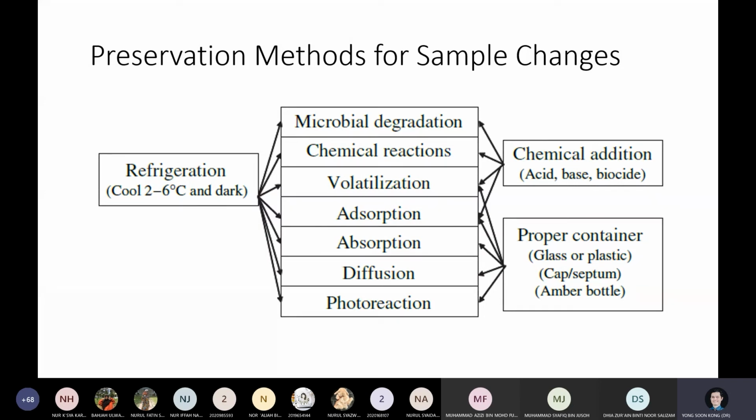I think for the reasons that we already discussed just now, because metal corrodes very fast. And when you have water inside, water actually serves as an electrolyte. And you have bacteria. Bacteria also release acid that actually helps the corrosion. So metal is a big no-no, I would say. For some reason, maybe there's a metal container, but most of the time they don't.